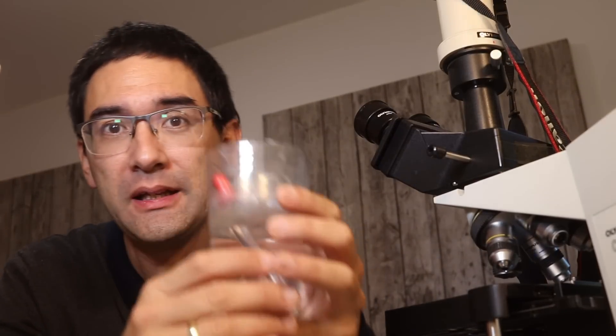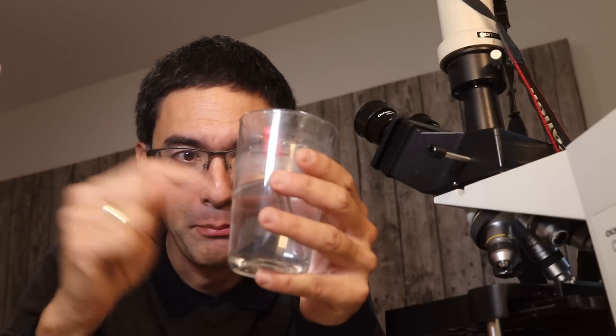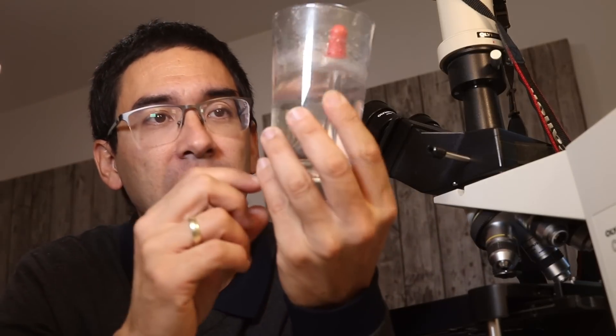Where do those critters come from? One possibility is they were growing on my skin in my beard, and when I shaved I put them into the cup. That's not a nice thought and it's also not very likely. Chances are good that while I let it stand for a few days, some ciliates were introduced from the air and started to reproduce because of the skin and beard pieces that served as food.